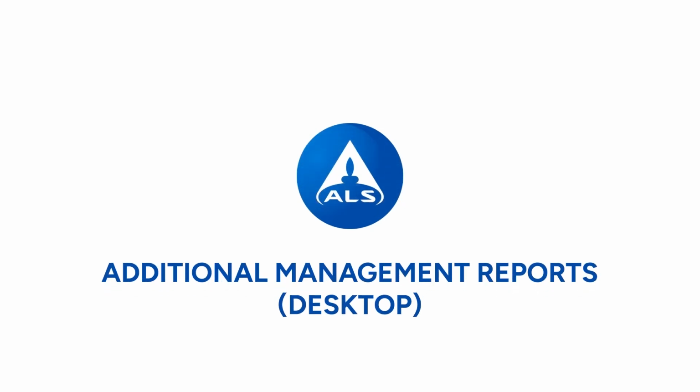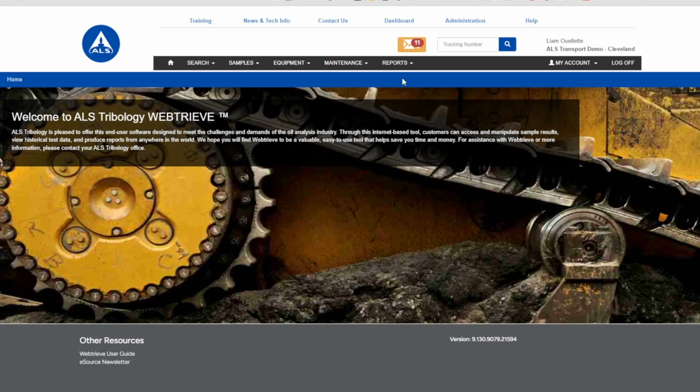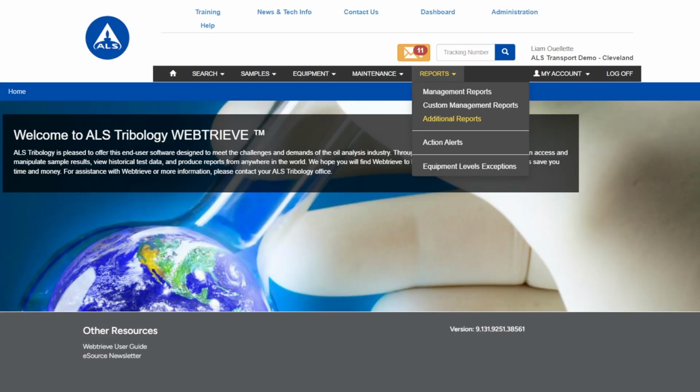In this video, I'm going to show you how to access additional reports on the Webtrieve desktop. Right here on the homepage, if you look up at the top level navigation, you're going to see the item Reports. Scroll down to Additional Reports.